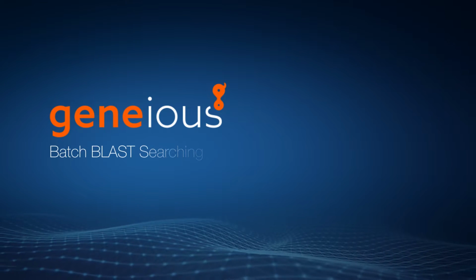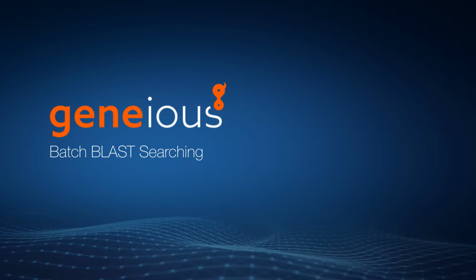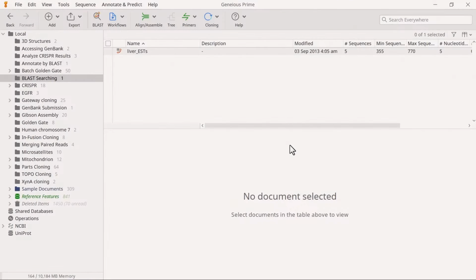Welcome to this video on performing batch blast searching in Geneious Prime. In addition to performing a blast search on a single sequence, Geneious also allows you to perform searches on multiple sequences at once, known as batch blast searching.